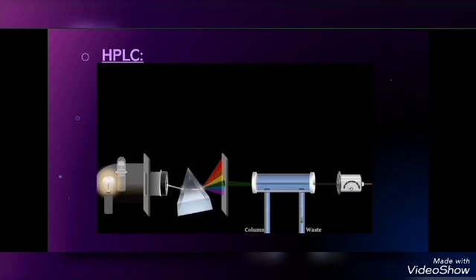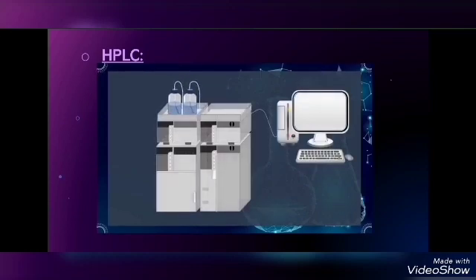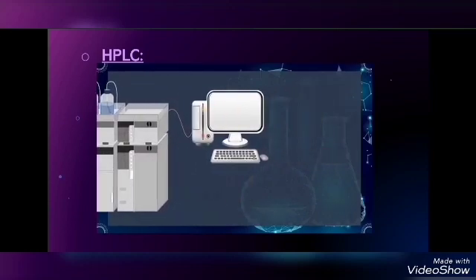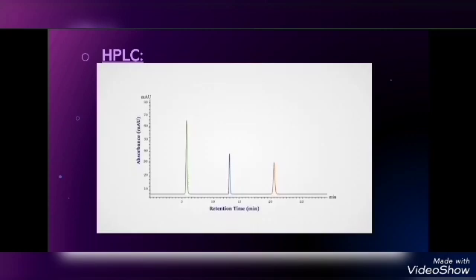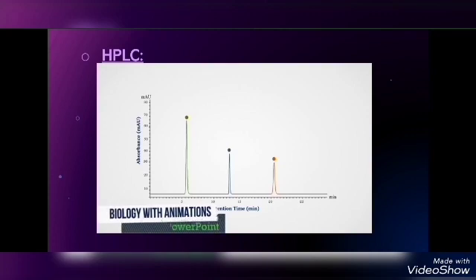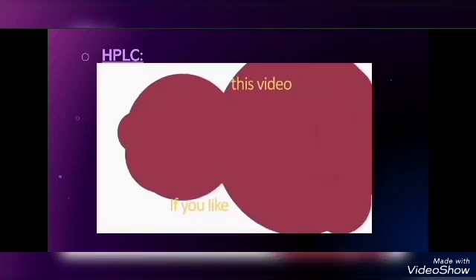The manner in which the final data is displayed is based on the computer and software. The number of peaks present can indicate how many components are in the mixture. Usually, the x-axis of the HPLC chromatogram shows the amount of time taken for the analytes to pass through the column and reach the detector. Typically, the y-axis, or the area of the peak, is a reflection of the amount of specific analyte that is present.